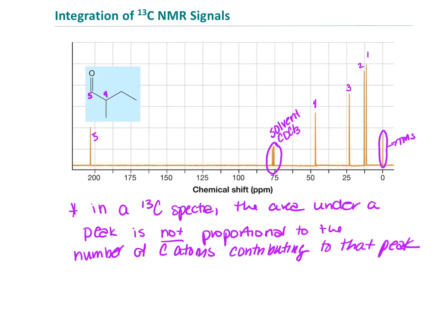And that's also an sp3 carbon, but it's an sp3 carbon that is a secondary carbon, right, instead of a tertiary carbon. And so when we look, I'm sorry, that's a tertiary carbon, right, because it only has one hydrogen attached.